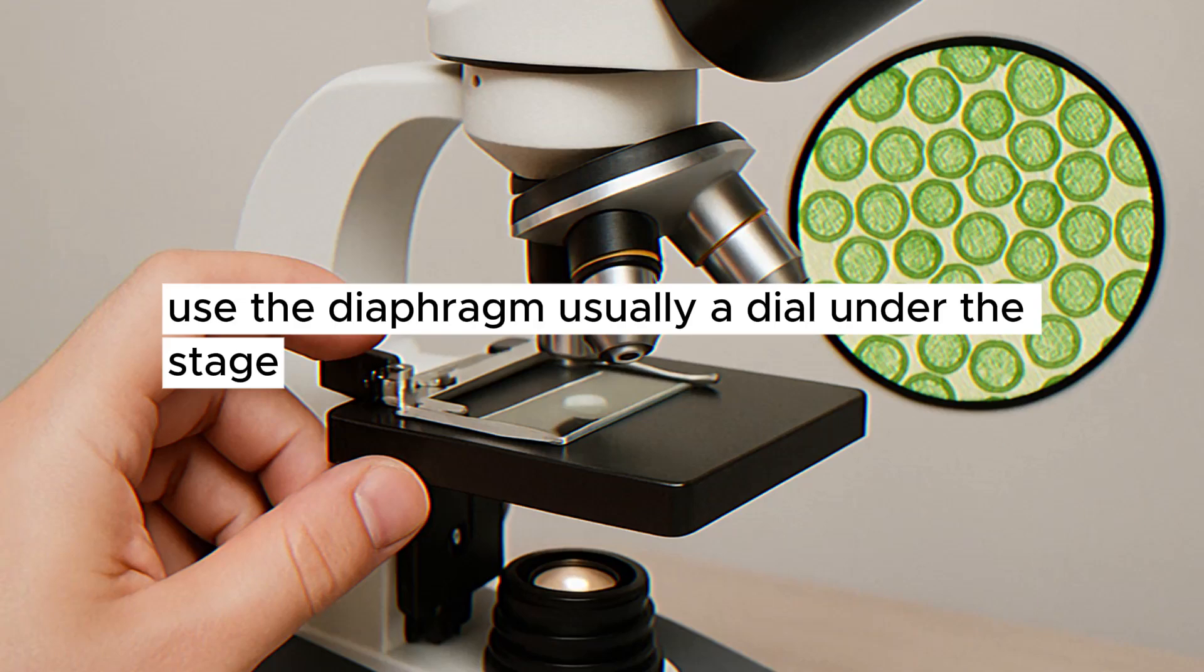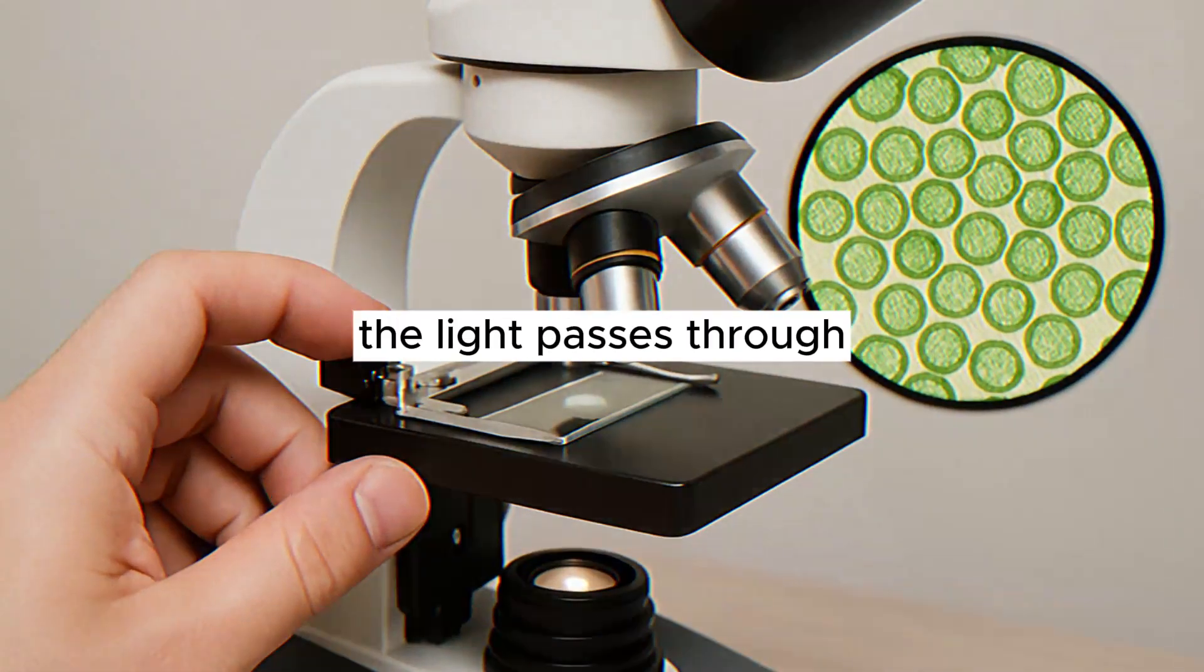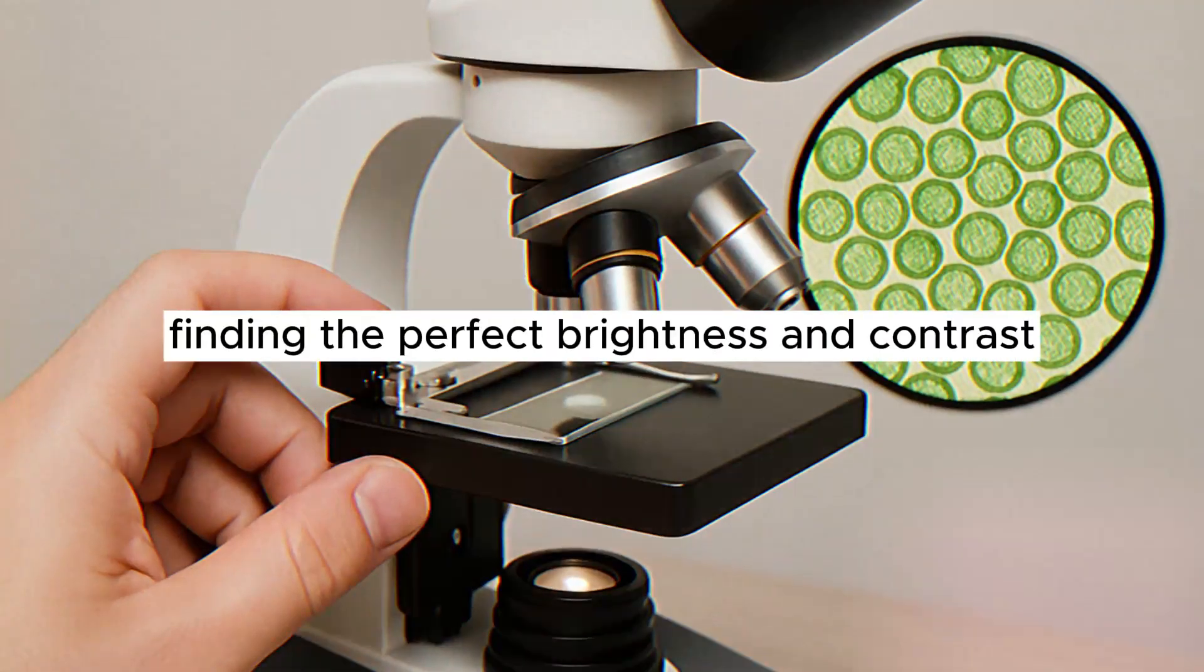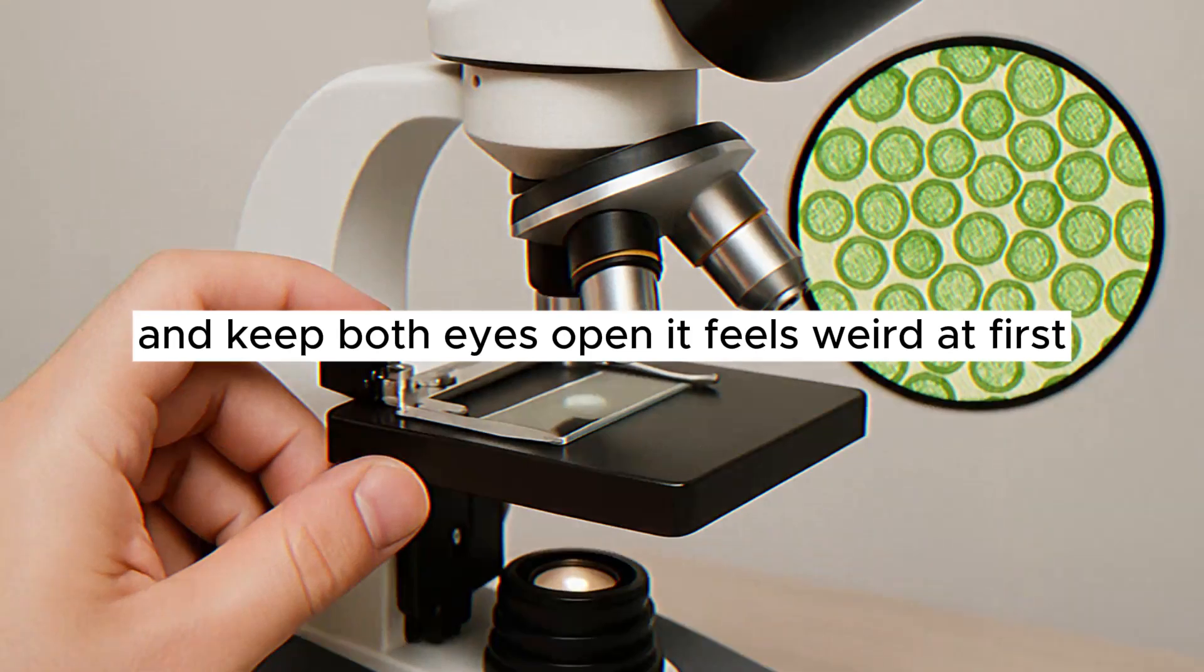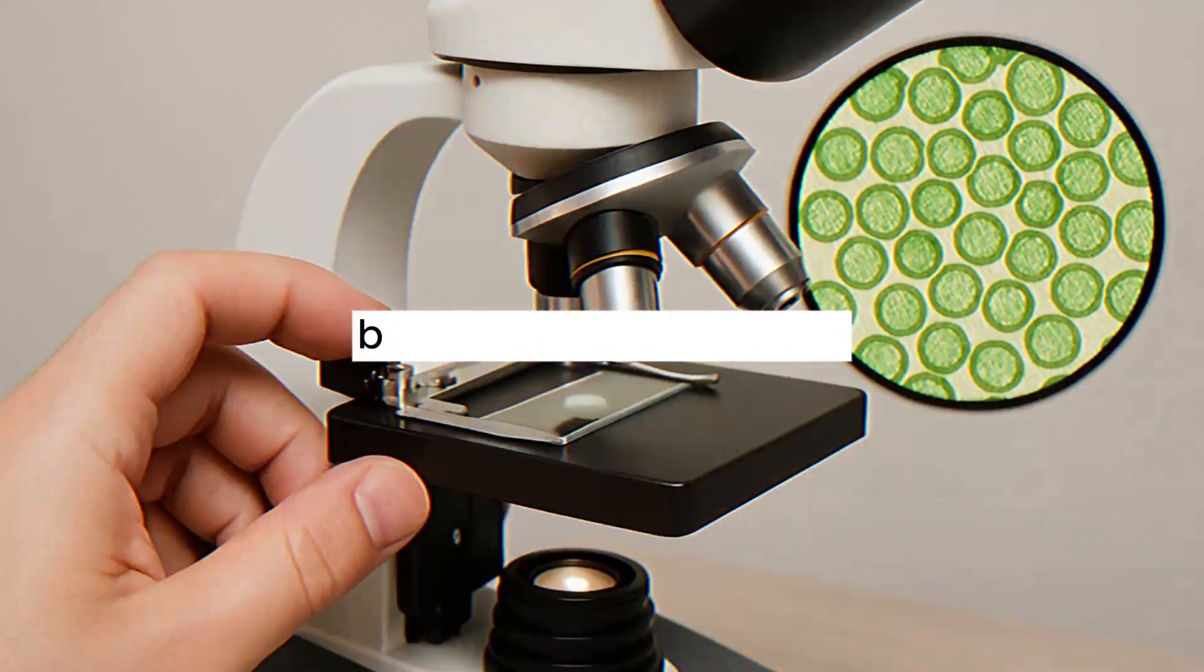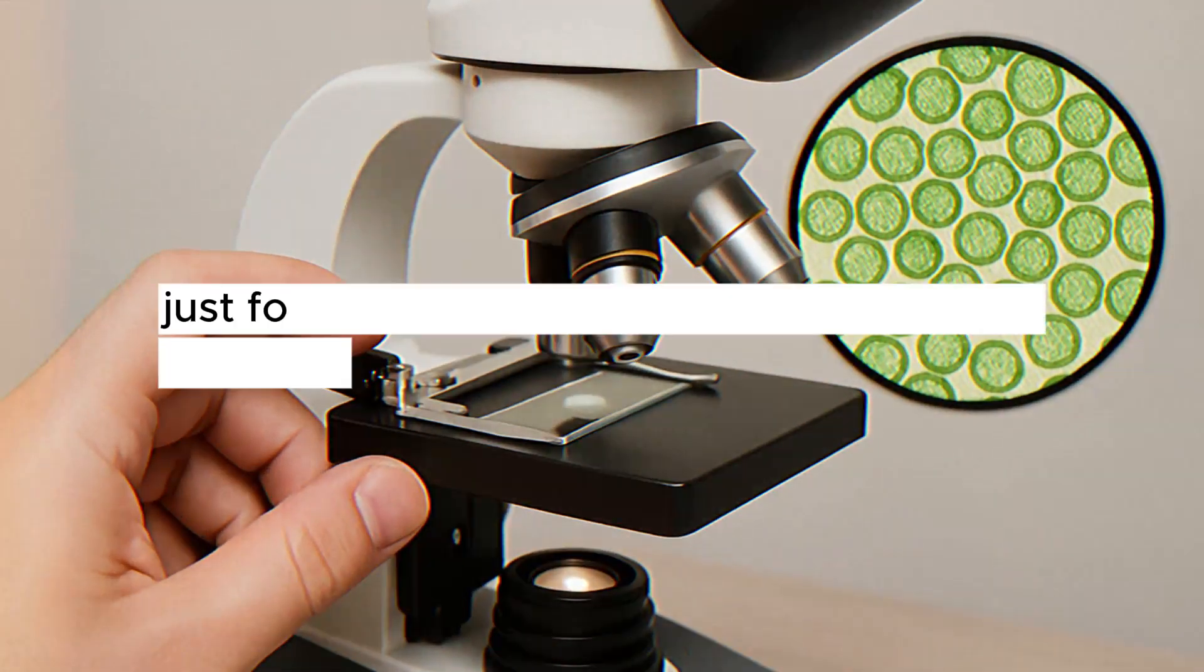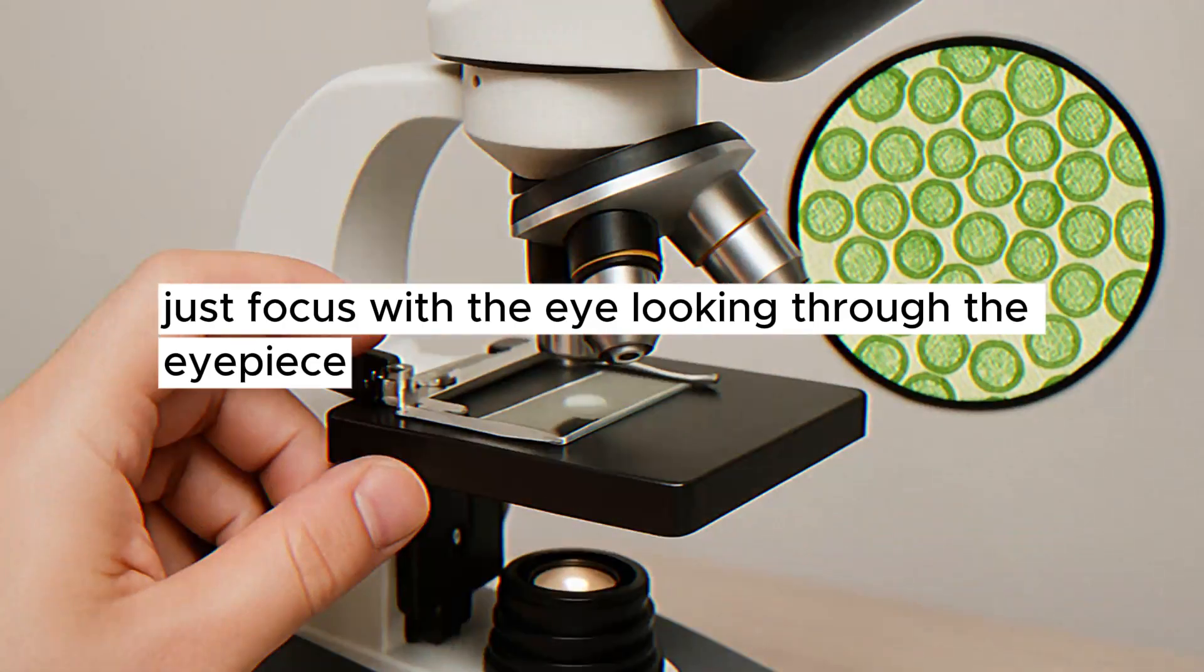Use the diaphragm, usually a dial under the stage, to adjust the size of the opening the light passes through, finding the perfect brightness and contrast for what you're looking at. And keep both eyes open. It feels weird at first, but it reduces eye strain. Just focus with the eye looking through the eyepiece.